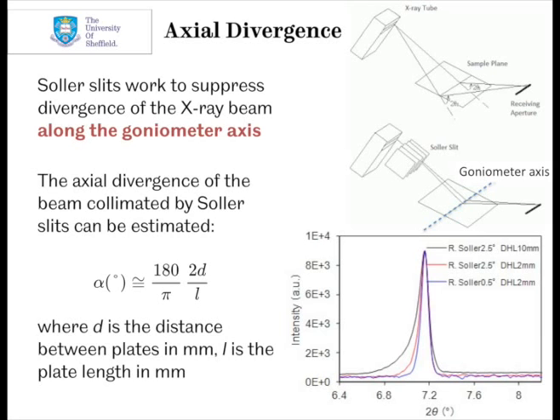X-rays travelling to the centre of the sample have a much shorter path than those travelling towards the outside — those diverging away from the goniometer axis. So by putting Soller slits in there, we can limit that axial divergence. The equation shown defines the axial divergence according to the size and spacing of the Soller slits: the longer the slits, or the more narrowly placed the plates, the lower the divergence angle. The graph shows the effect of axial divergence — for bigger Soller slits with greater spacing or shorter length, you see a real asymmetry on the low-angle side, sometimes called the umbrella effect. Broad peaks at low angles can hide other peaks, so the Soller slits really tidy up peak shapes.